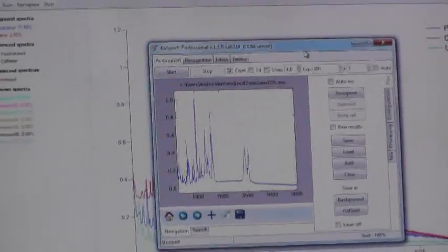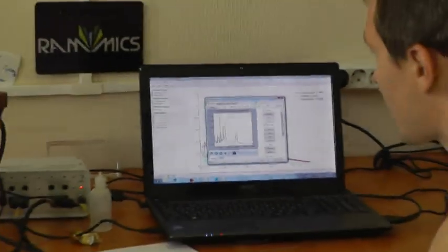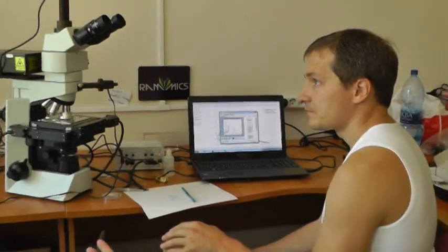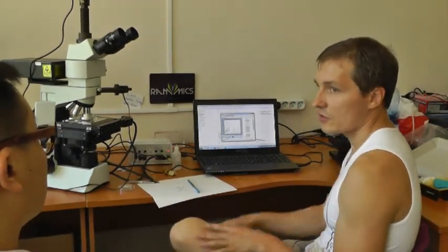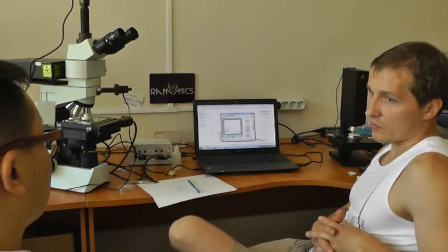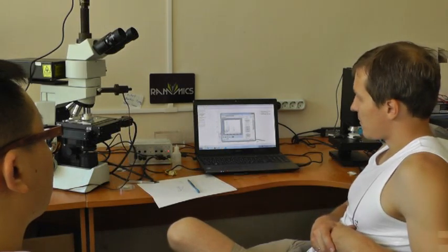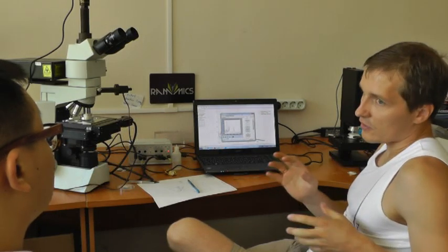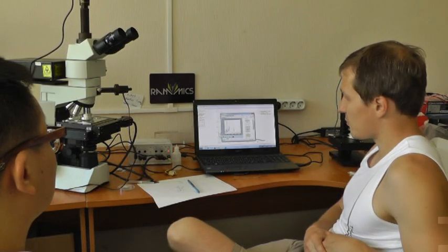We should have some compromise threshold value to distinguish different spectra with different line positions from just noisy variations of the same spectrum. Here, I think we have a case with different spectra of different noise level. That's why we have quite a lot of unknowns.